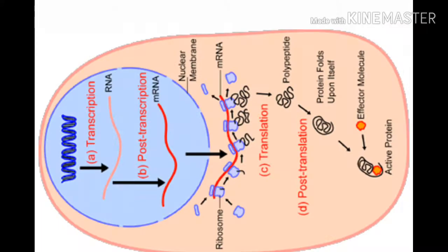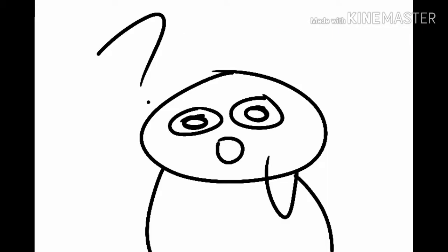5. Several colonies are checked to identify one with the right plasmid, for example by PCR or restriction digest. 6. A colony containing the right plasmid is grown in bulk and used for plasmid or protein production. So why do we need to check colonies? The bacteria that make colonies should all contain a plasmid, which provides antibiotic resistance. However, it's not necessarily the case that all of the plasmid-containing colonies will have the same plasmid.